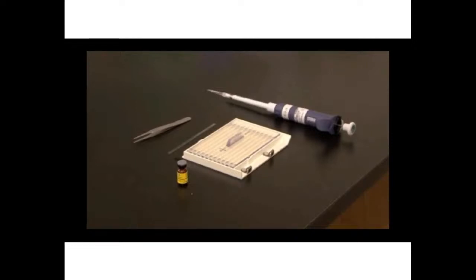Trays are available for all IPG strip lengths. Tilt the tray toward you to allow for even distribution of the sample. An easy way to do this is to take the focusing tray and put it on the edge of the lid to the focusing tray, so you have the tray at an angle towards you. Dispense sample along one edge of the lane of the tray. And you want to dispense it in a nice even bead from one electrode across to the other. One even bead. I have shown you this with the focusing tray, but this can also be done with the rehydration tray.